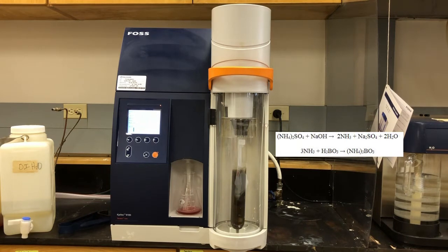And once all the alkali is in, the steam distillation starts. You can see the bubbles being produced there in the tube. That's being pumped into the sample tube through the steam tube. And that will run now for about 5 to 7 minutes until all of our ammonia is collected in the receiving flask.